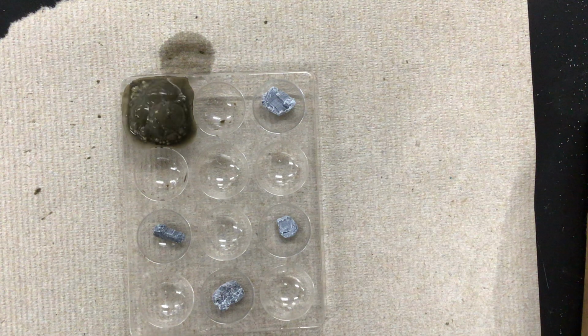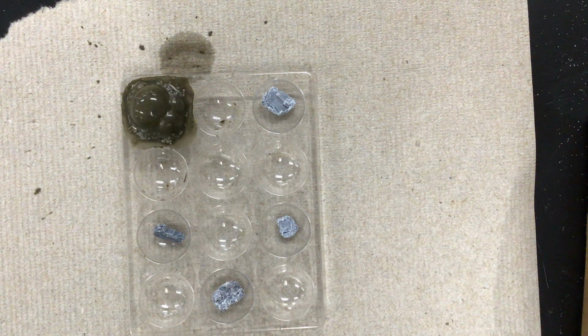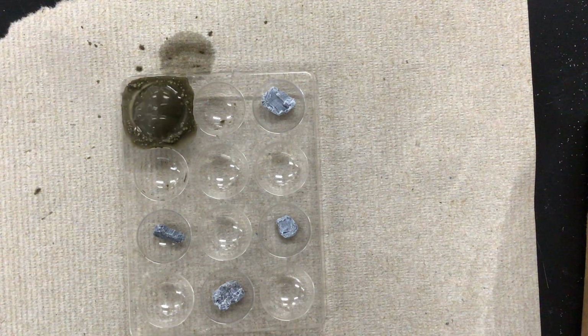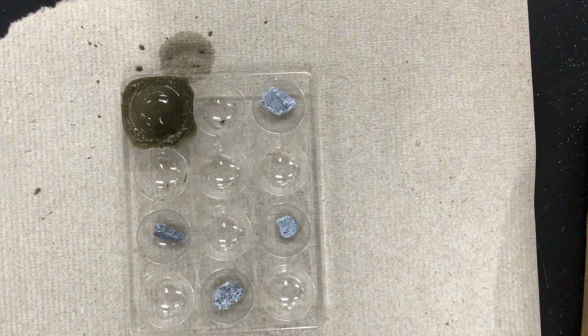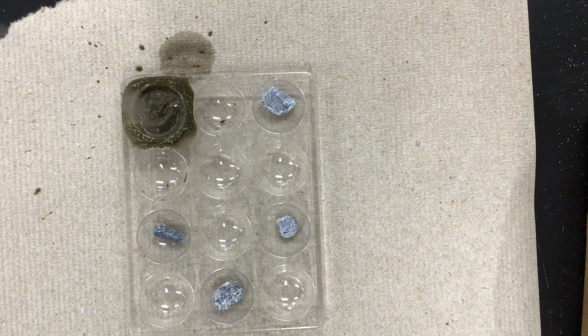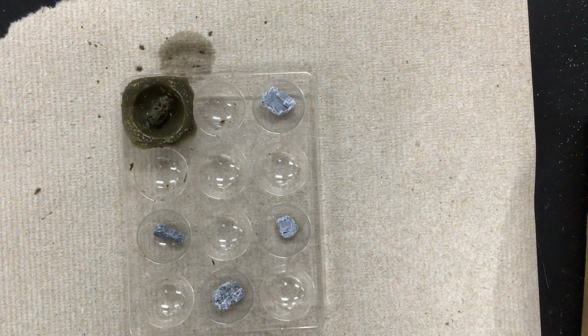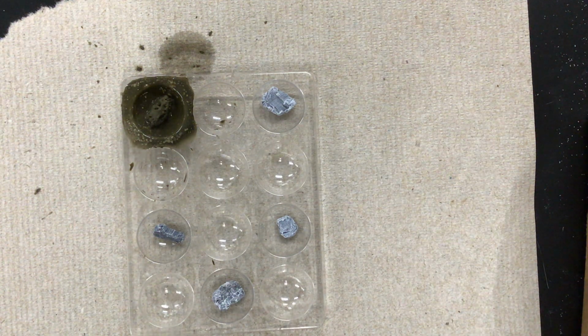I don't know if you can hear it, but it is sizzling. And it's definitely making a mess. Ooh-wee, that was kind of violent. Look how gross that looks. So that was calcium and silver nitrate.